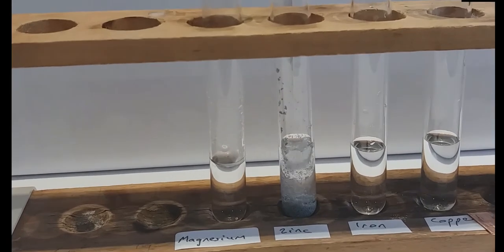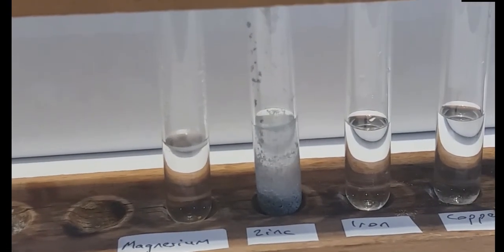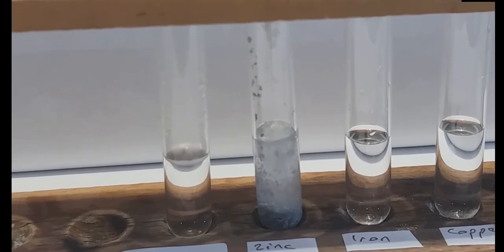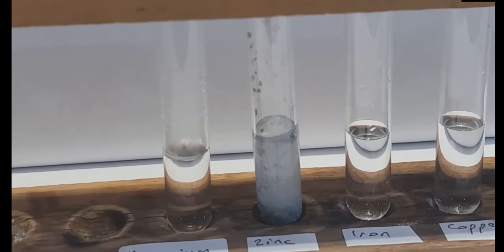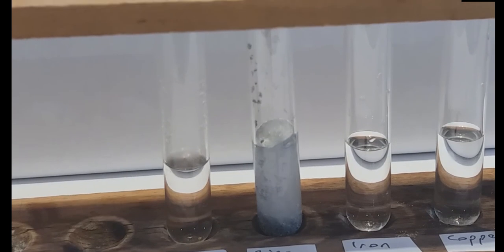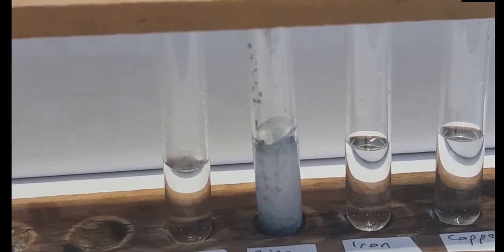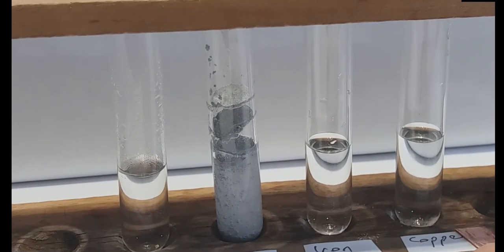And look how much faster it's reacting than it was as a lump. Now it's still not as good as the magnesium. We had to powder it. We're getting a few bubbles given off, but nowhere near as much hydrogen as there was with magnesium. So it's a bit less reactive than magnesium, and in fact when I tried to pop it, it didn't work. So we're not getting enough hydrogen off quickly to get that good pop test.